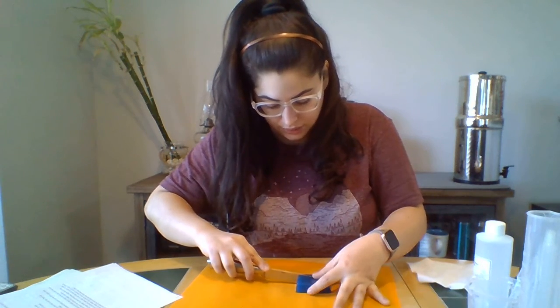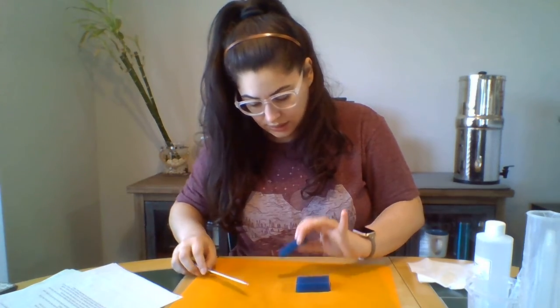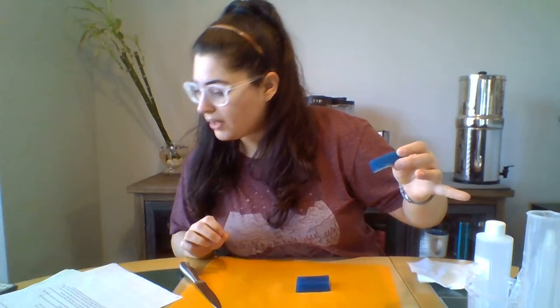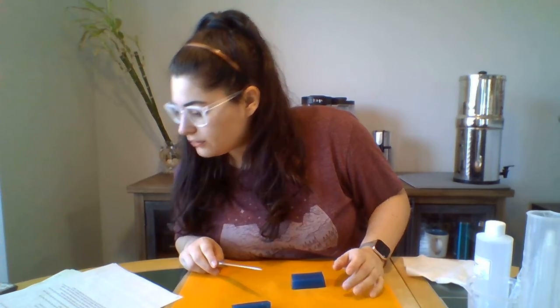Whoa, yeah, it cuts like Jello too. Wow. Okay, so there is the 1 by 1 by 6 centimeter block. Just set that there. And then the rest, we have 1 by 1 by 1, 1 by 2 by 2. Okay.